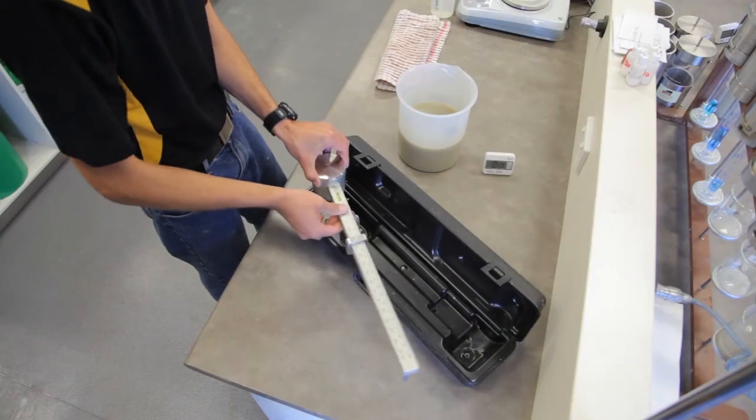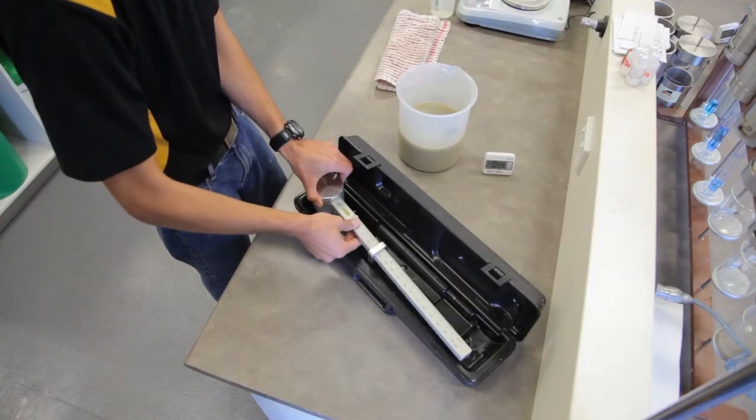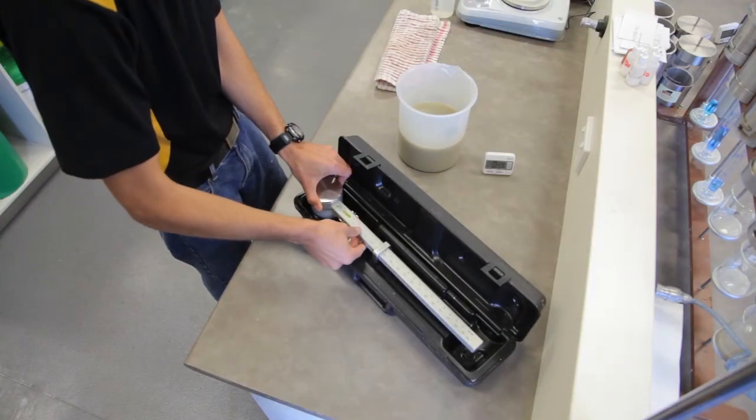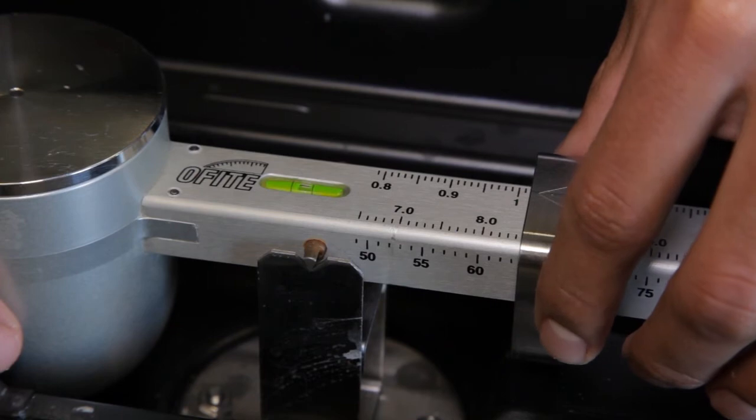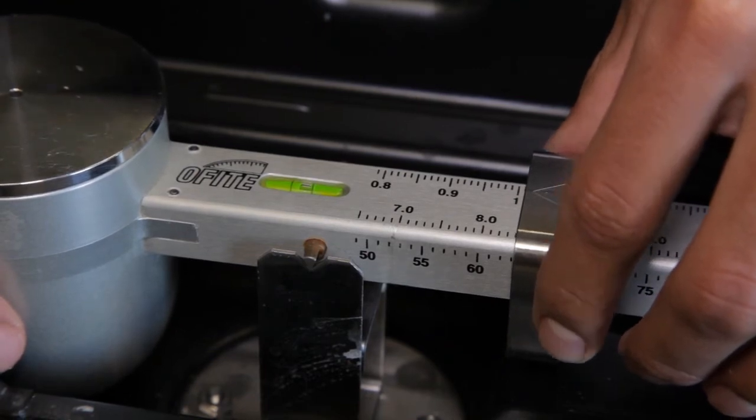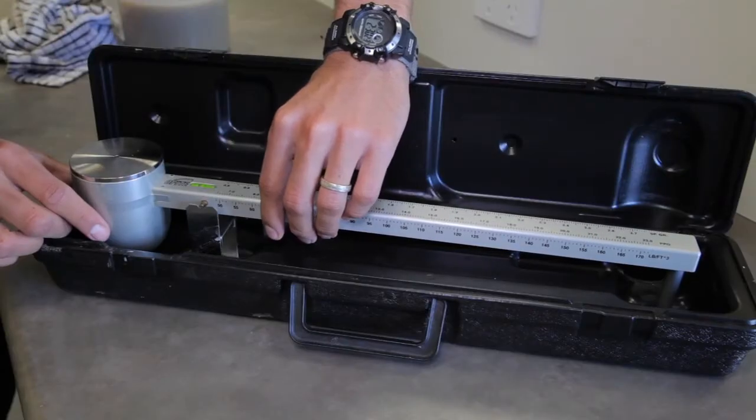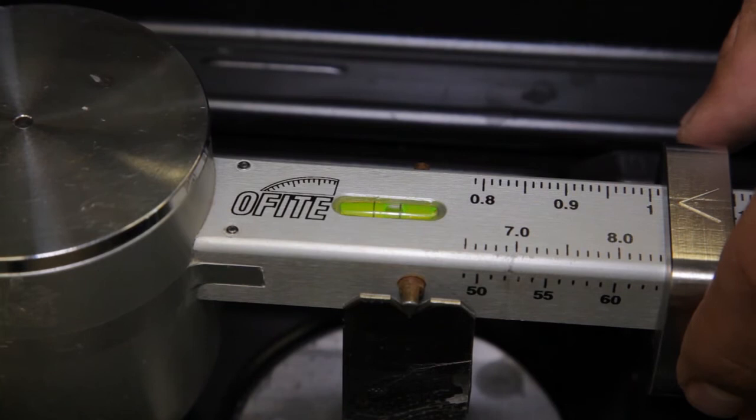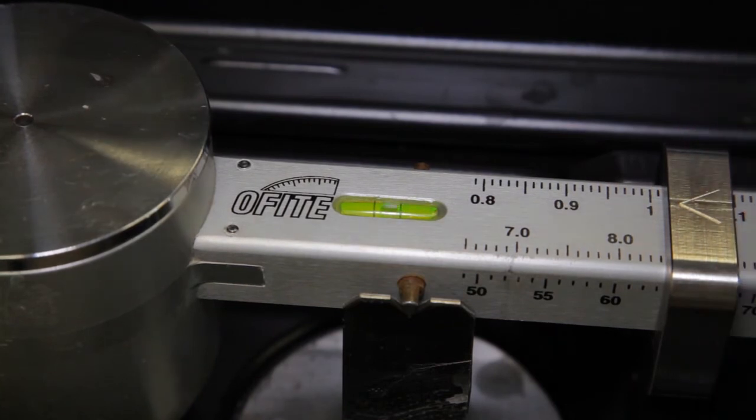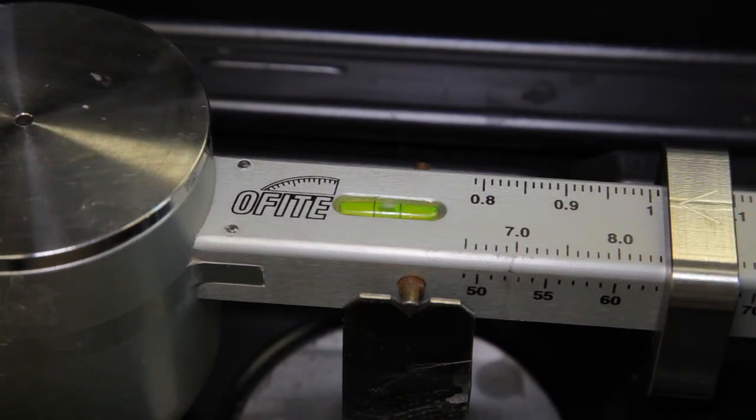Place the balance on the fulcrum and adjust the weighted slider until the bubble in the spirit level shows that the balance is level. The scales are very delicate and it can take some time before the balance will settle.